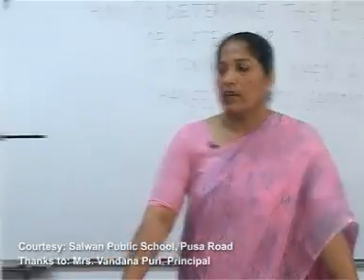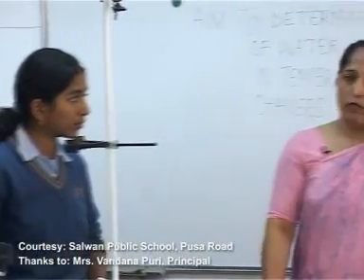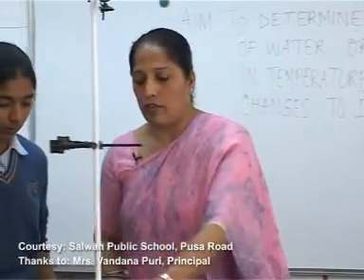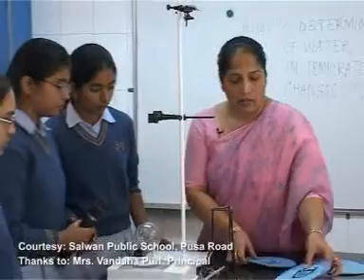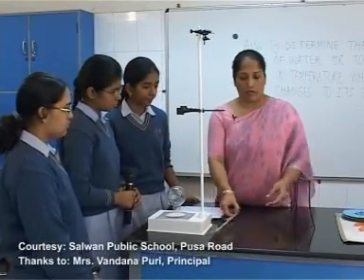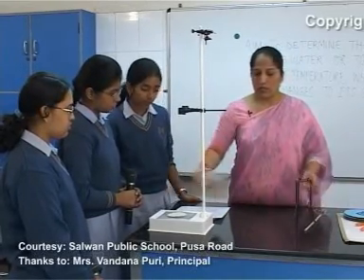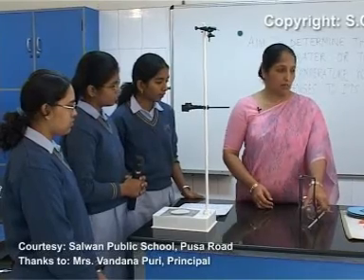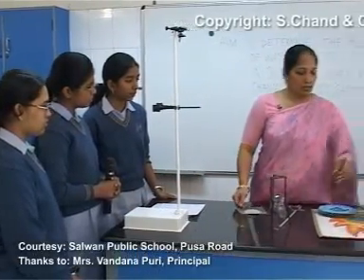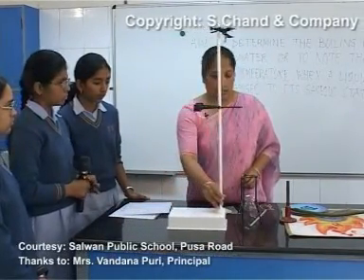Shall we record this temperature? Yes, we will record this temperature. When the boiling starts and the temperature becomes constant, we will start noting it down. Now let us look at the apparatus — what things are required for this experiment. This is a tripod stand, this is a thermometer to record the observations, this is a flask for the water sample, this is a wire gauge, this is a burner, and this is the iron stand. We will fix up the apparatus and then start taking observations.